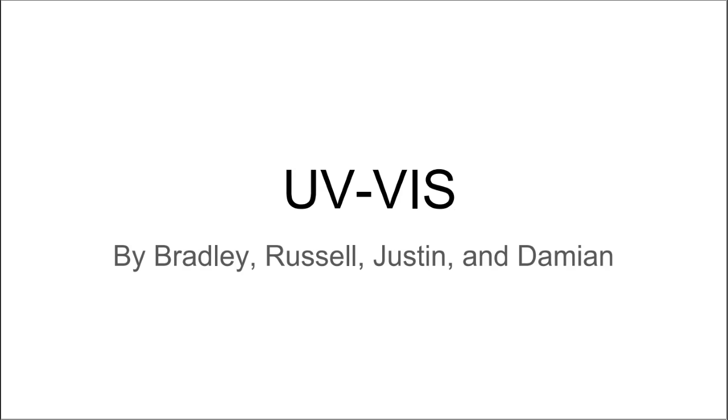Hello everyone, and welcome back to Chem 112. Today we will be discussing ultraviolet visible spectroscopy. We will go over what it is, how it works, and how it relates to quantum mechanics. To begin, let's go over what it is.